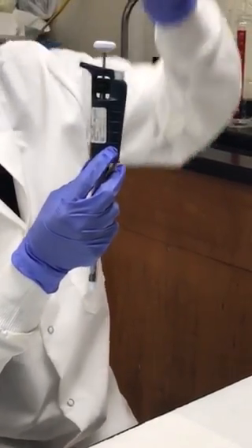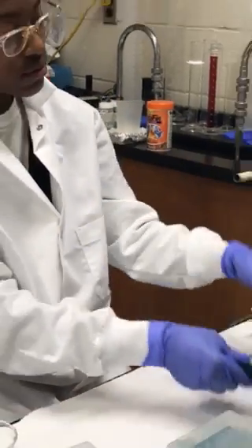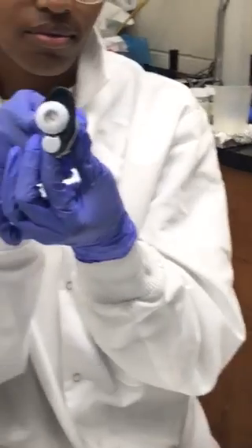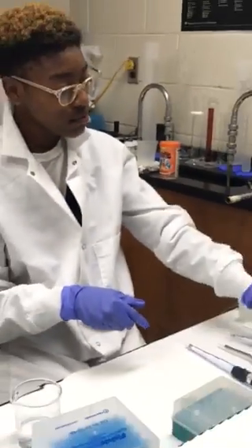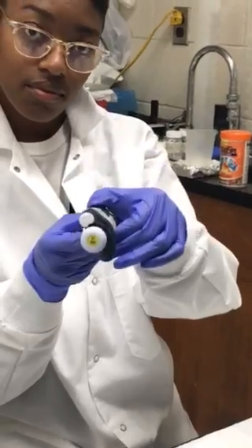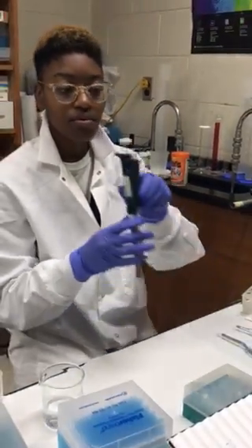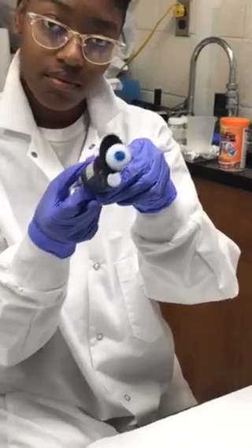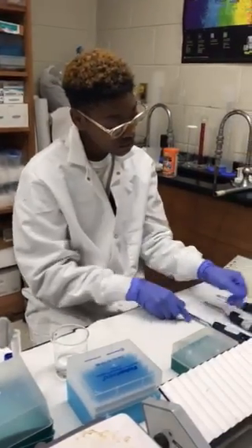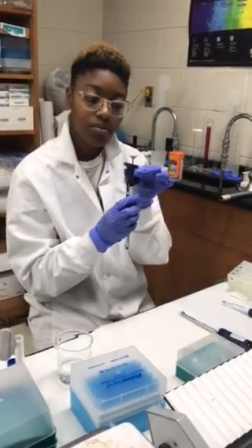Each pipette has a specific range that it cannot exceed. For example, P2 cannot exceed any range of volume after 2 microliters. P100 cannot exceed any range of volume after 100 microliters. And P1000 cannot exceed any range of volume after 1,000 microliters. If volume is increased past max range, you are at risk of damaging the instrument.